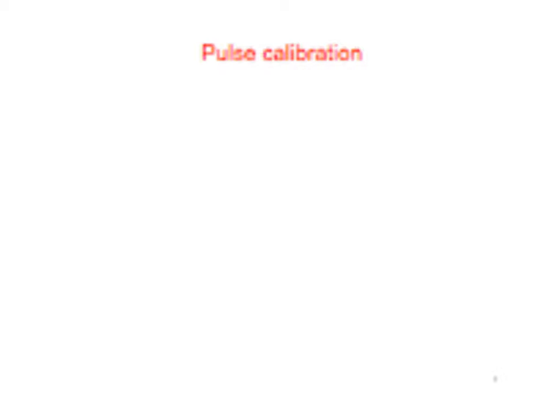All right, so let's first look at pulse calibration. This is how we would determine the 90 degree pulse, or a 180, or any of these pulses. Essentially what we're going to do is run an experiment just like we did before. We start at this point.